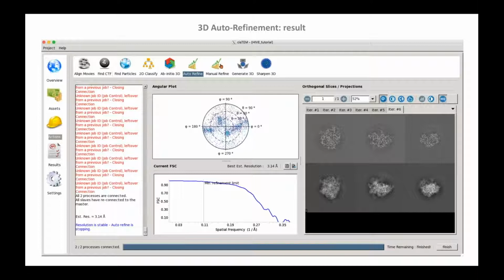But now the program has evolved, and now we don't necessarily. What happened to your limited space of the... Yeah. I thought that you were using class average for example as well. 3D class averages. So 3D classification, not 2D. You can see things in 2D, okay, but it's an important caveat.